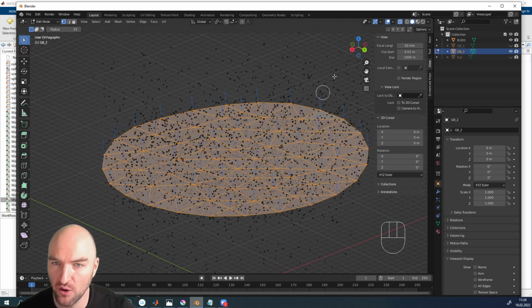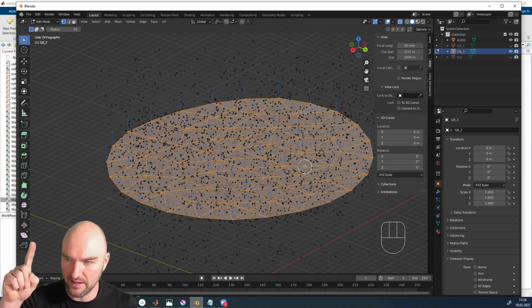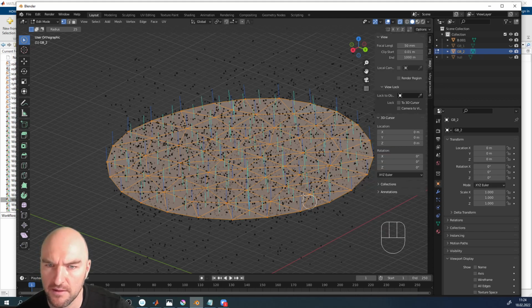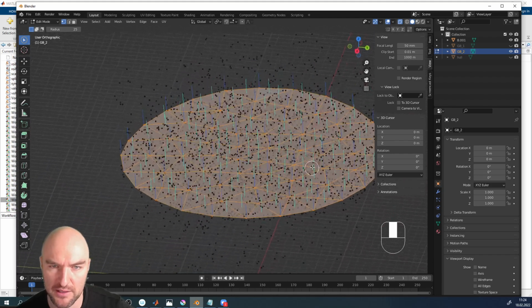By the way, the vertex normals are calculated because a vertex itself, a point, doesn't have a normal. But rather, what you calculate is the surface normal of each of the neighboring triangles, and the vertex then has the average normal of the neighboring triangles. And so let me just show the face normals. So you can see now you use the face normals and the vertex normals.